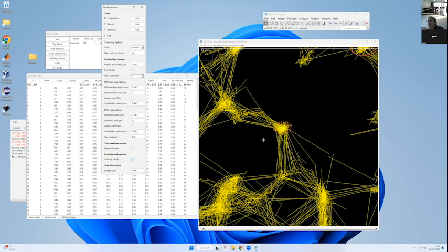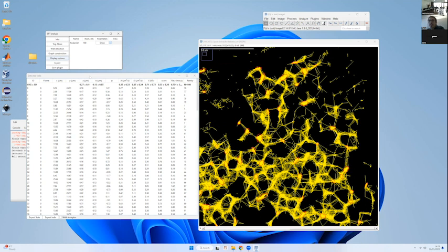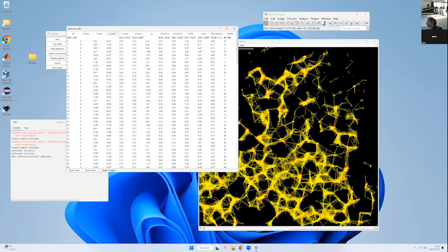Okay. It's fine. It's not a very big thing. You have the next time to make sure that they are the same well. If for example the center is almost the same, but it can have some fluctuation. What do you click for this? You click at the beginning when you download the image.